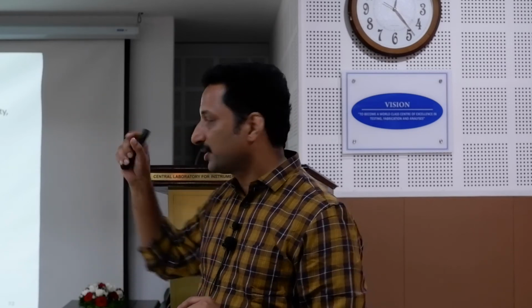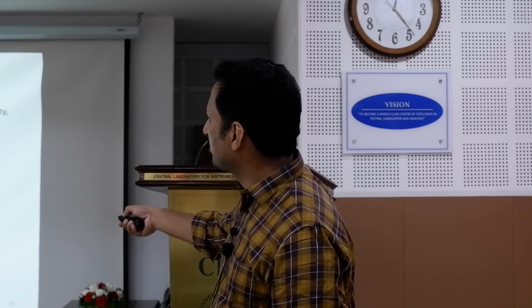Now it comes almost like an STM, okay. The tip is conducting, but the sample doesn't have to conduct; a sample can be insulating. We are not going to measure any current, but the tip has to conduct. In Kelvin probe, what we are going to measure is the work function of the material. It's a very useful technique, actually more useful than STM, because STM needs the sample also to be conducting. Here, even if the sample is not conducting, we can get it.